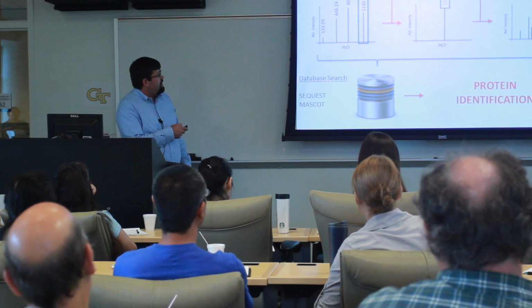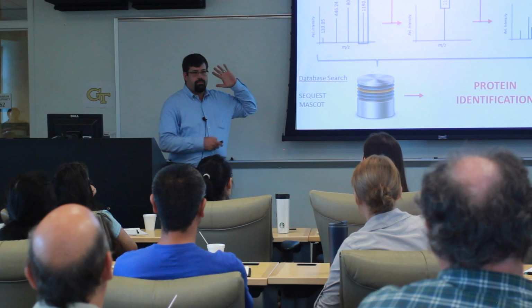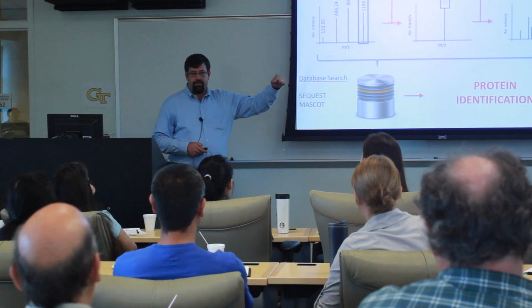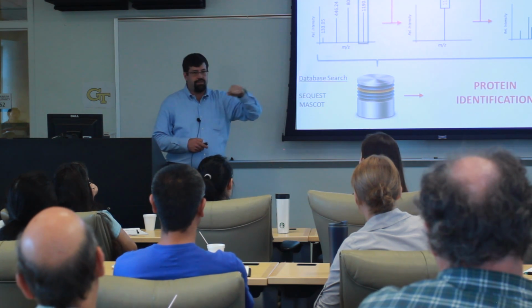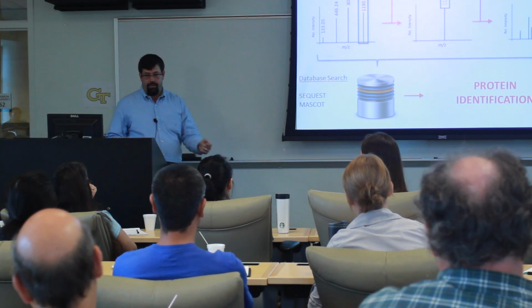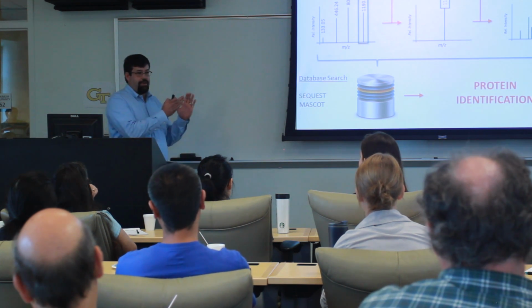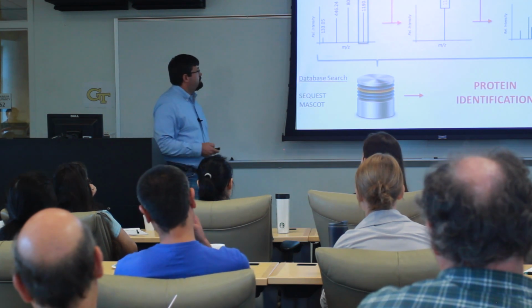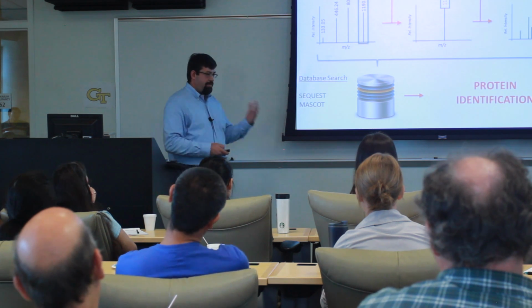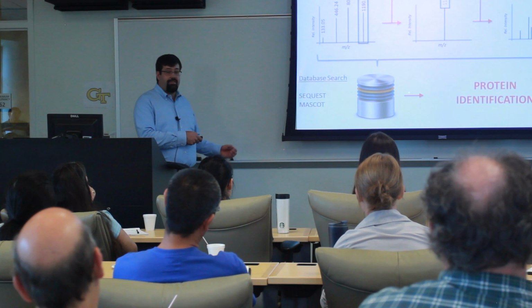So instead of you picking these 3 peaks, you can say, take an MS spectrum, fragment the top 6 most intense peaks out of that MS spectrum. And all of that data is collected very, very rapidly. So within 5 minutes, you've analyzed the spot, you've fragmented a number of peptides within that spot, and you now have both MS and MS-MS data, which can be searched in online databases that are actually free.